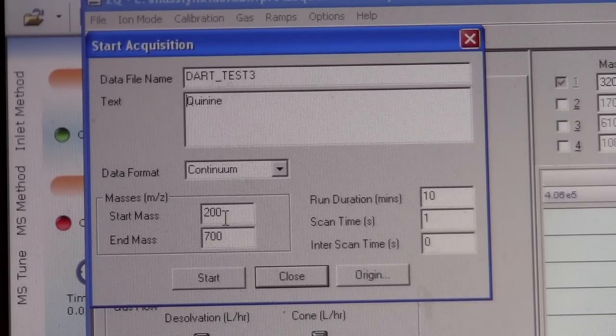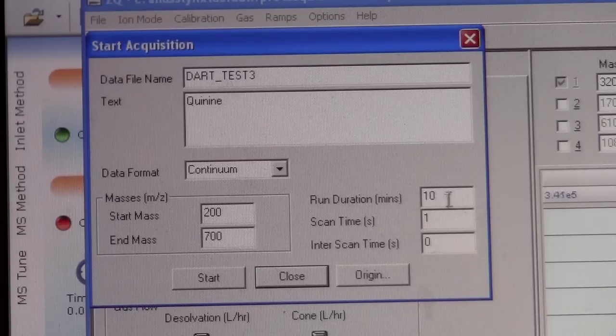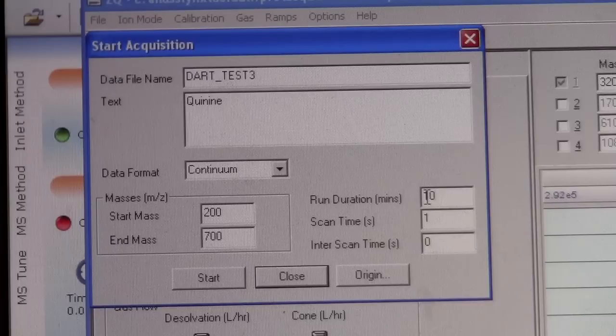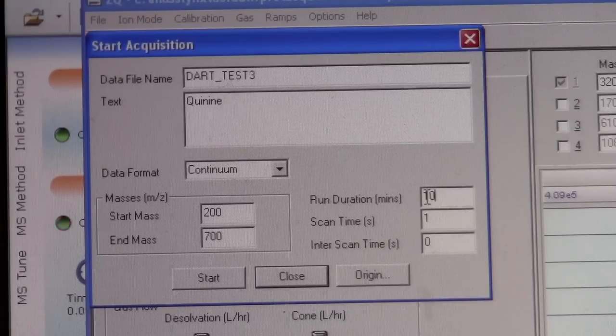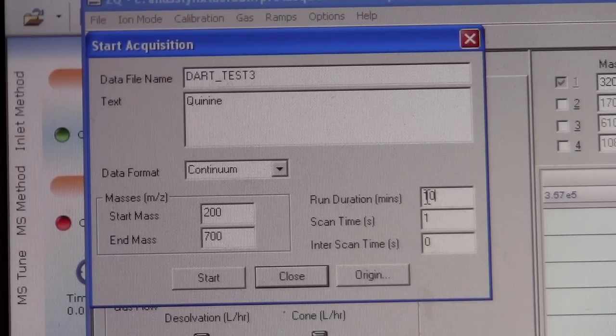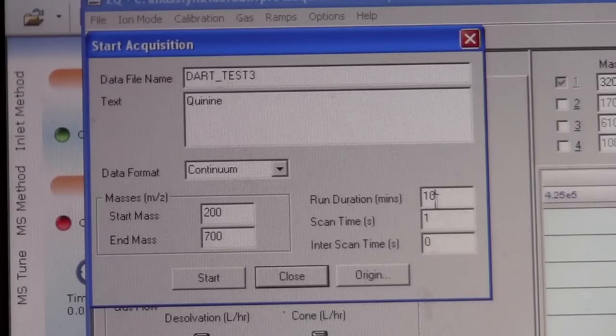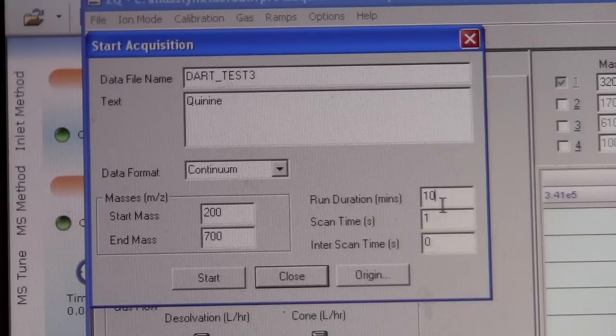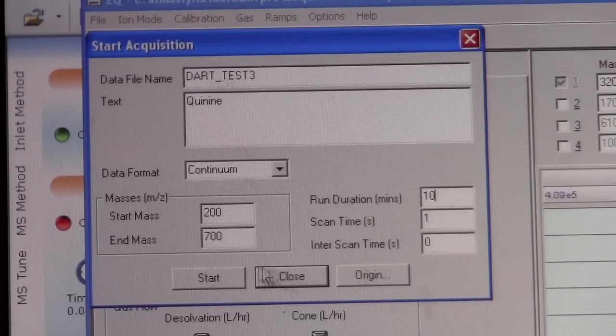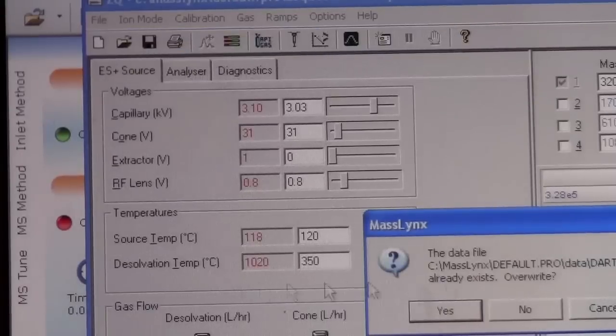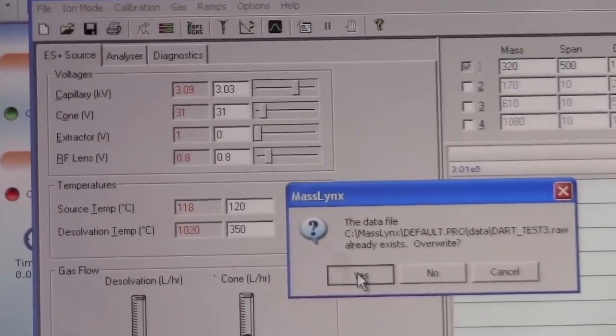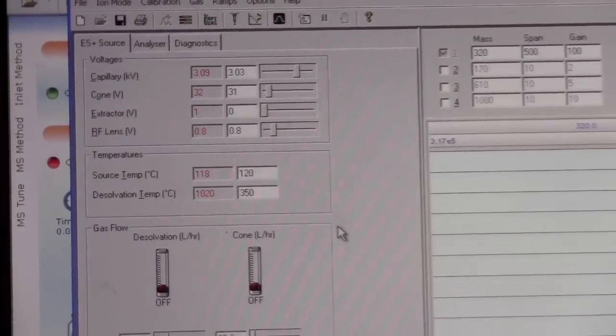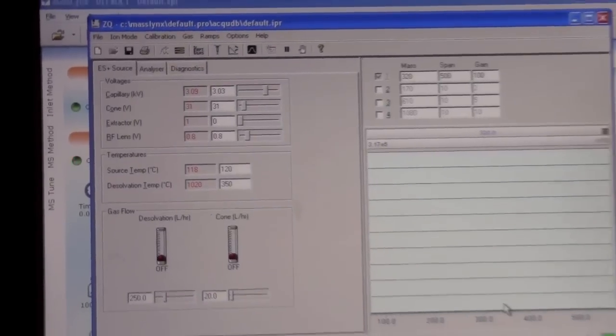Continuum data format. We can set the mass range and then the run duration. This run is how long you want to have it run while you put the sample into the instrument. This is all set reasonably. We can click start. In this case we already have a data set, we're going to overwrite it. So now this disappears and we're running.